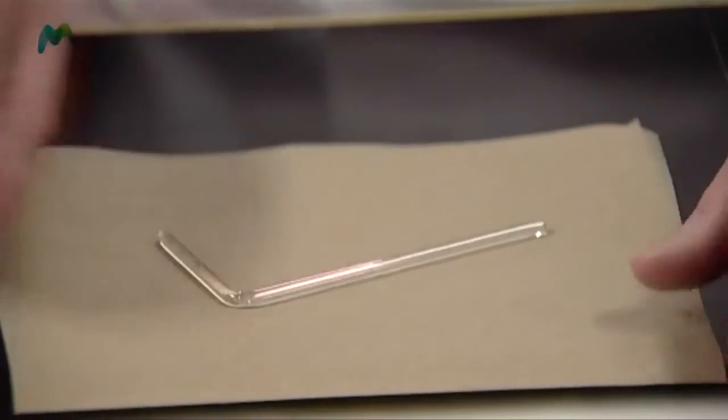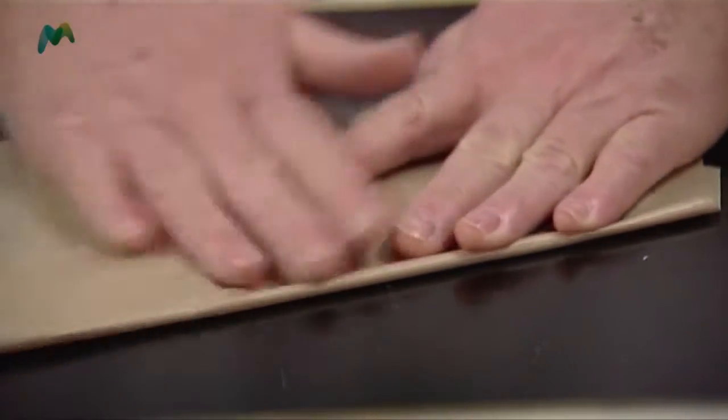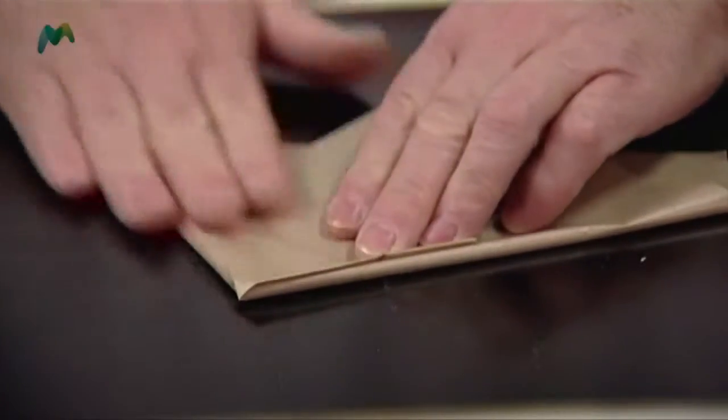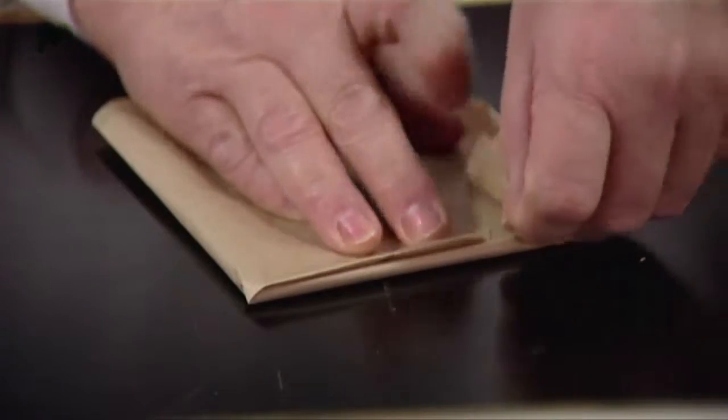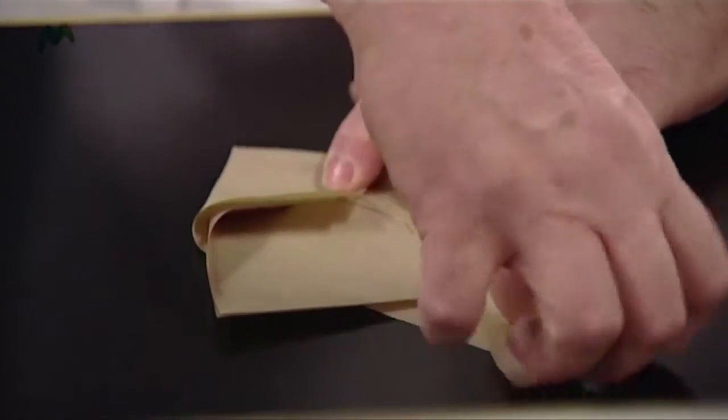I've got here some greaseproof paper. I'm a believer in folding it in half so we've got two pieces. We place the spreader in the middle and then we fold diagonally across so that the spreader is in the middle. We fold that end in like that, this end in like that, and I find it easier to turn it round.